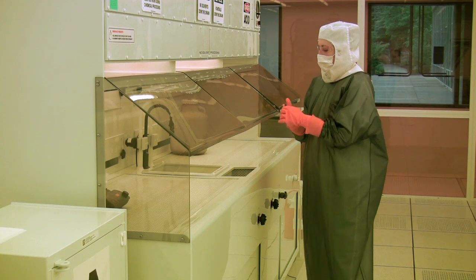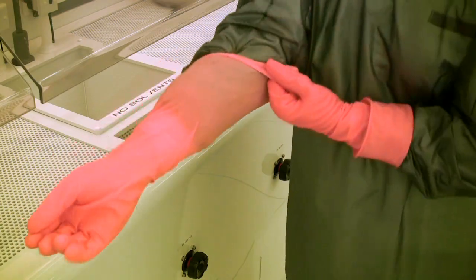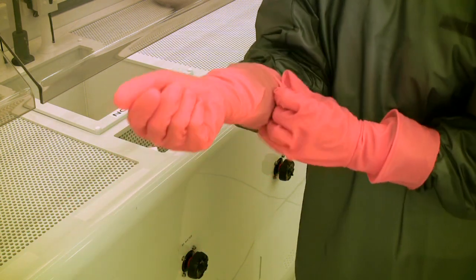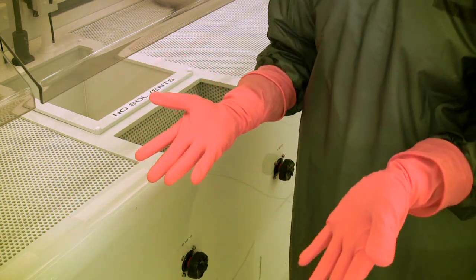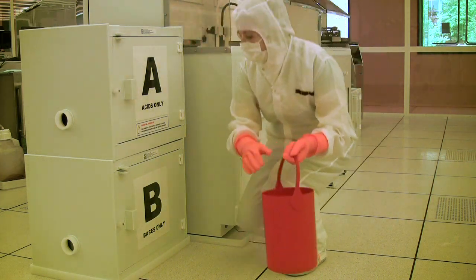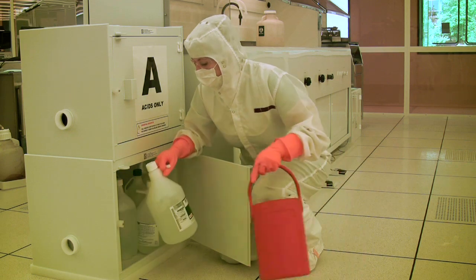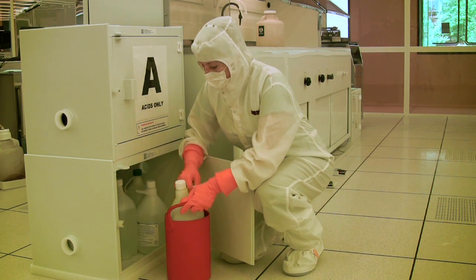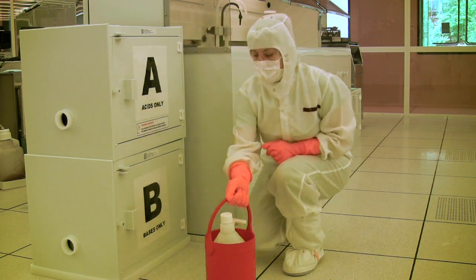The gloves should be pulled over the sleeves of the apron and then cuffed. Cuffing is done by folding the sleeve of the glove inside out over itself. The idea is that the cuffs will catch any chemicals on your hands from dripping onto the sleeves of the apron and then back inside your gloves. On a side note, whenever you are handling bottles of acids or bases, especially bottles that have already been opened, it is a good idea to wear acid gloves, as there is always the chance of residual chemical on the outside of the bottle.